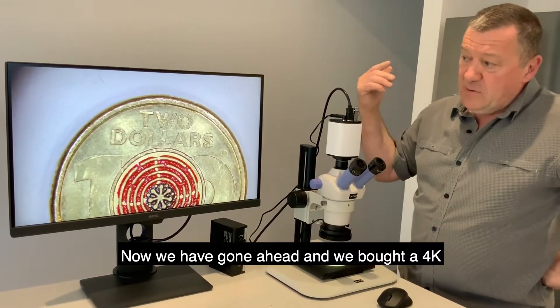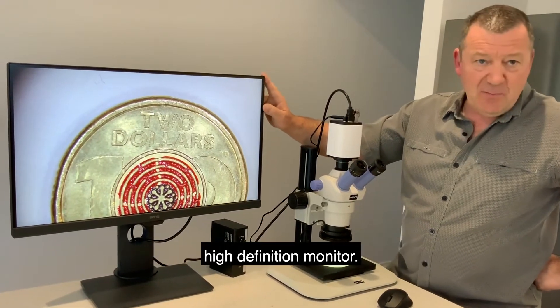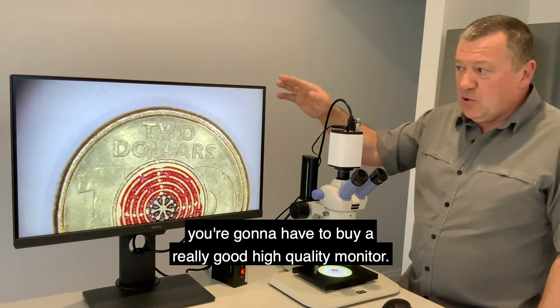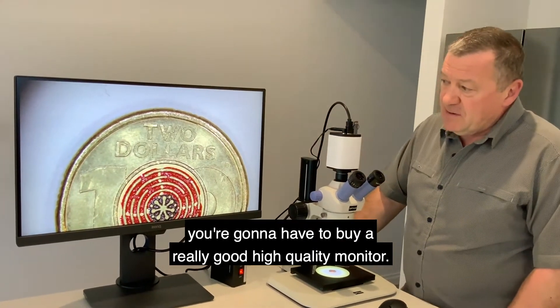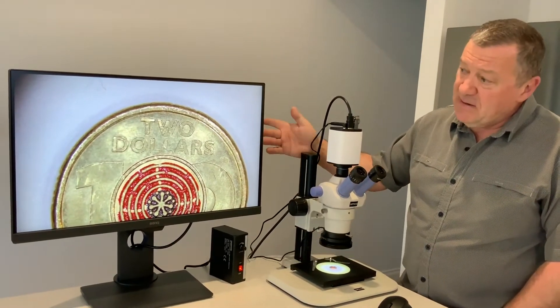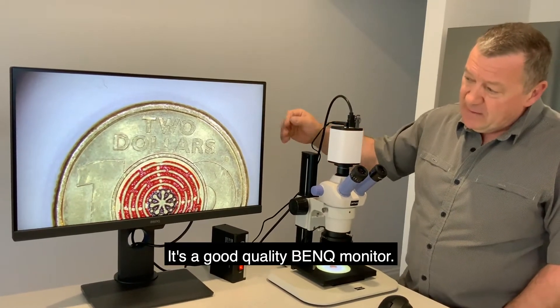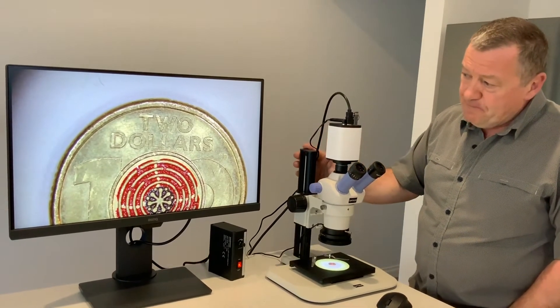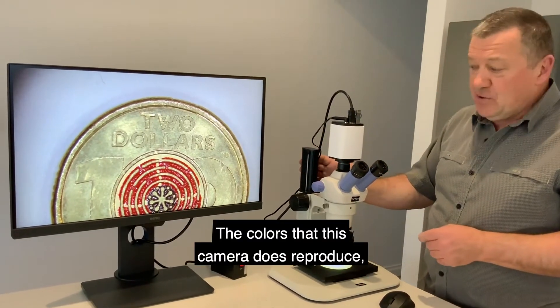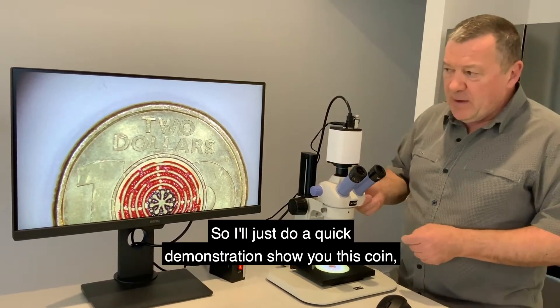We have gone ahead and bought a 4K high definition monitor, so if you do buy this camera you're going to have to buy a really good high quality monitor. The price of these are coming down recently — I paid $850 for this monitor. It's a good quality 4K monitor and the colors that this camera reproduces are quite astounding.